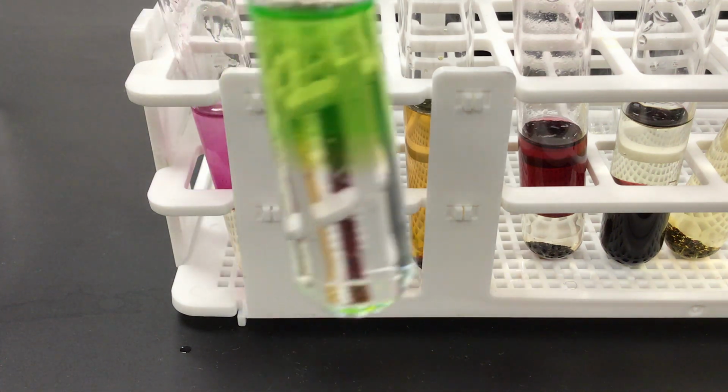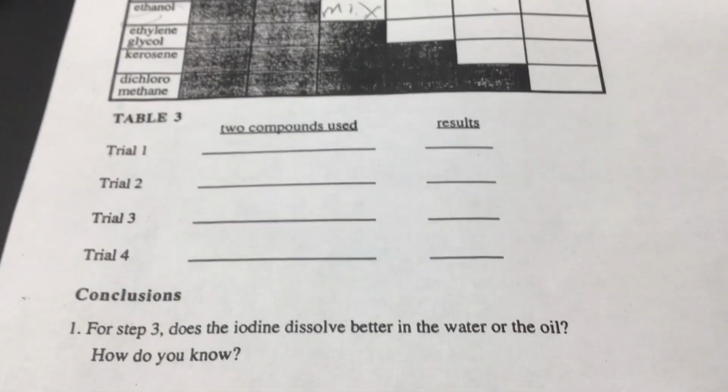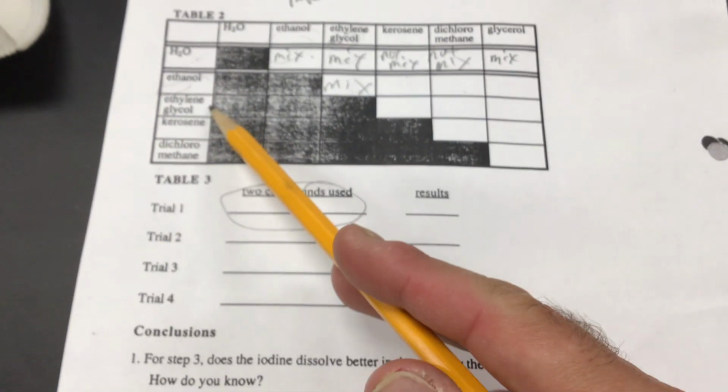They did not mix. So you would write those in right there. We tried ethylene glycol and we tried dichloromethane.